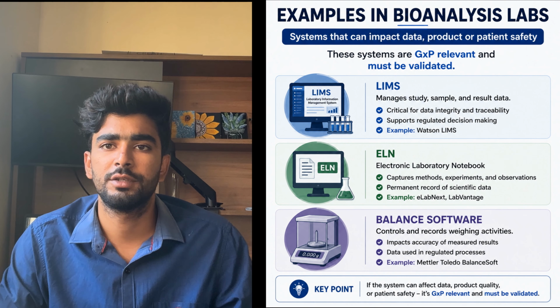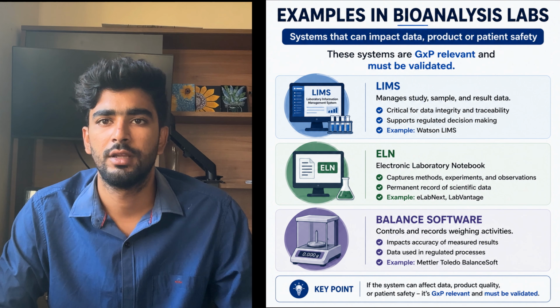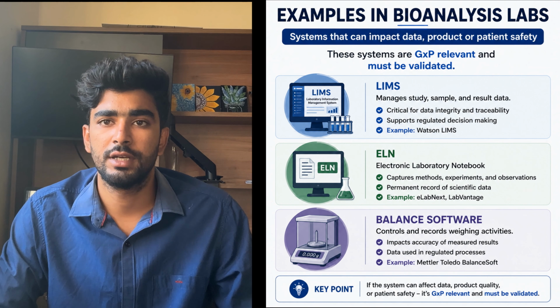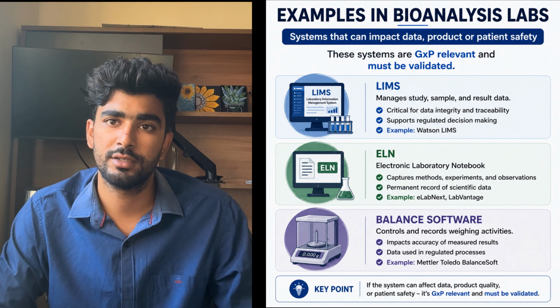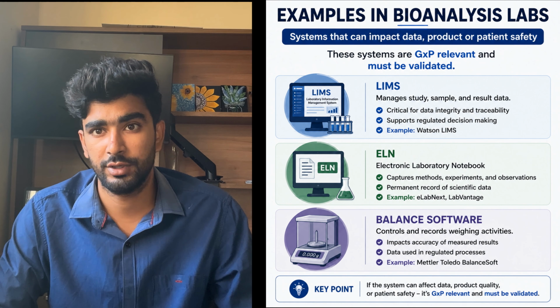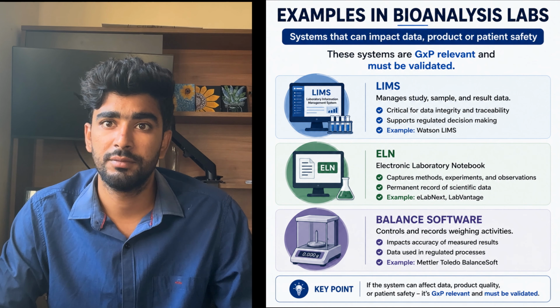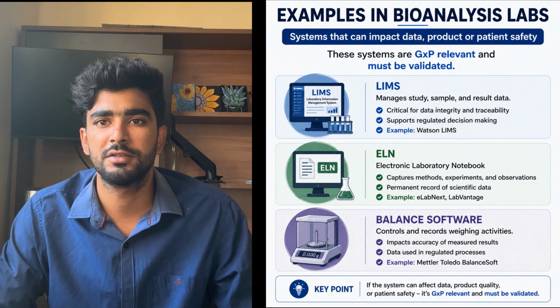A laboratory information management system, LIMS, often stores study sample data, test results, and often generates COAs, certificates of analysis. That is patient safety data. If that data is wrong, patients could be affected. Then obviously it's a GxP relevant system.